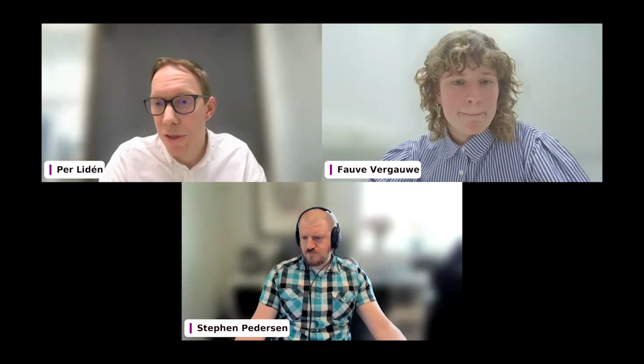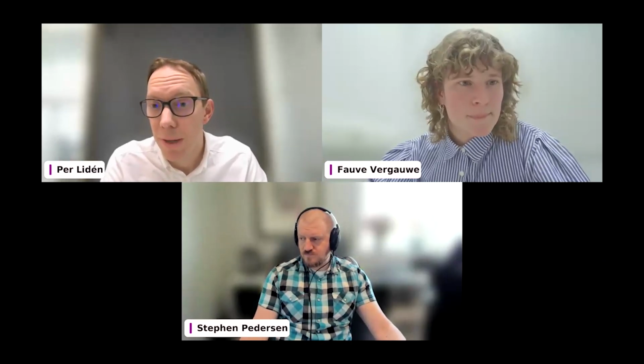Yes, a question here on complex biofilms. I'm interested in multi-species biofilms, for example, grown from saliva samples. Is there any limitation for these complex biofilms? I don't think so, because we love complex biofilms, and we also love working with very complex growth media, because there's no limit to the type of matrix that's in there.